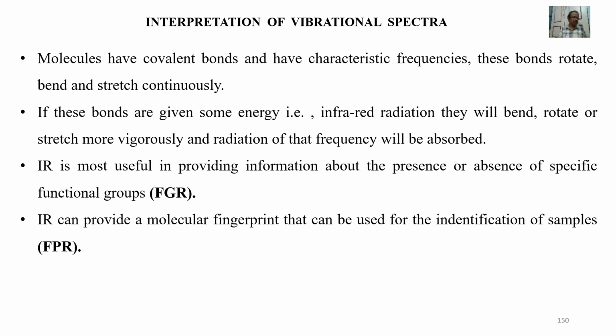Interpreting a vibrational spectrum involves analyzing the peaks or bands present at specific frequencies to identify the functional groups and bonds within the molecule, essentially acting as a molecular fingerprint to identify unknown compounds or study the structure and dynamics of a known molecule by examining which vibrational modes are active and at what frequencies.